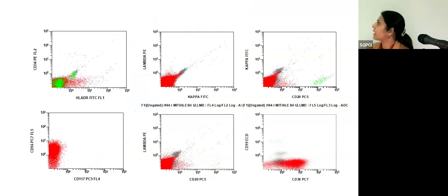So this was a lymphoid tube I had put initially. You can see here the kappa and lambda are also negative, because when we put a B tube, we also establish clonality, right? So CD19, CD10, CD20 negative, kappa, lambda negative. CD117 is also negative here. CD56 is heterogeneous. Can you see this? CD56 is expressed by the blasts or the atypical cells. And CD38 is also expressed. So here's a population expressing CD38 and CD56. It is negative for all B markers. Clonality we cannot establish because it is not expressing either kappa or lambda.